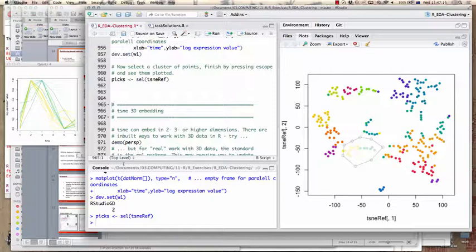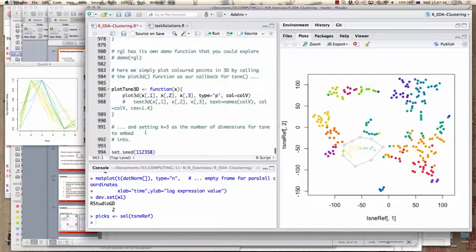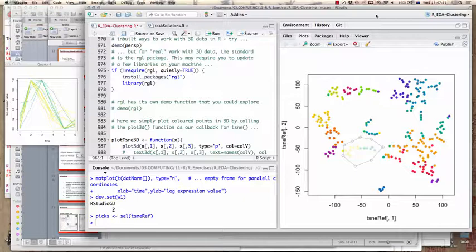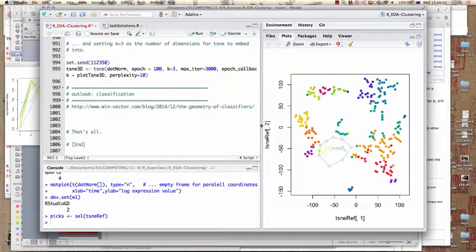Surrounding a cluster of points with a polygon and pressing escape identifies all points inside and plots them. In this example, we can see a certain similarity between these points that TSNE has brought into the same vicinity, and affinity propagation nicely distinguishes between somewhat different structures in the time course. A similar approach for t-stochastic neighbor embedding can also be done in three dimensions. I think this is all I wanted to say about clustering.